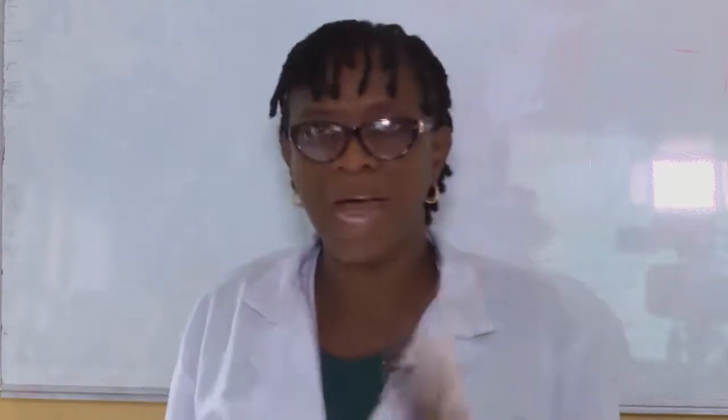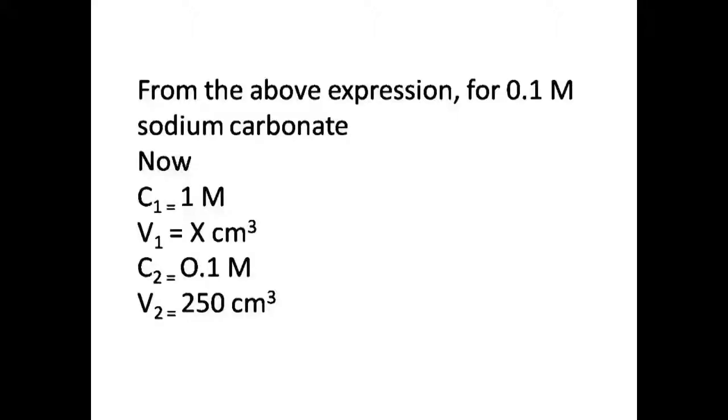Now, from the data we have, our C1 is 1 molar, the 1 molar we prepared in experiment 1A. The V1 we do not know. That's what we want to determine.